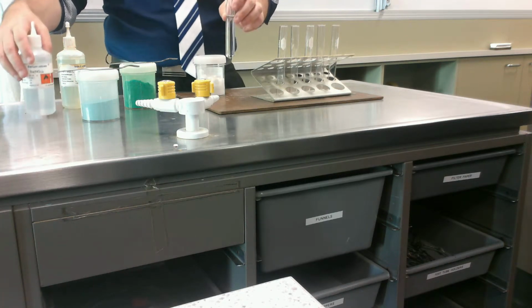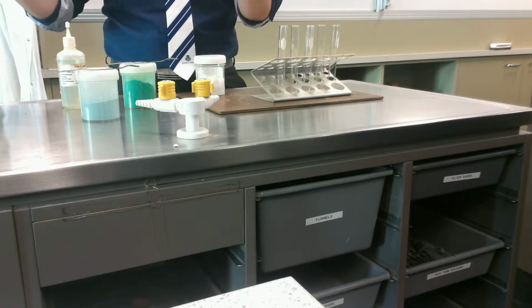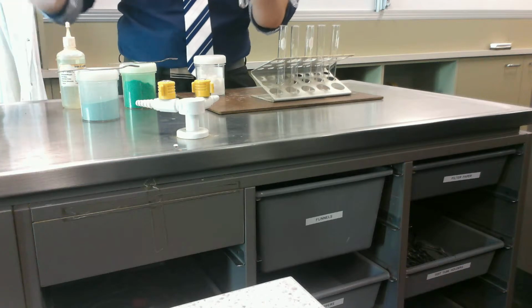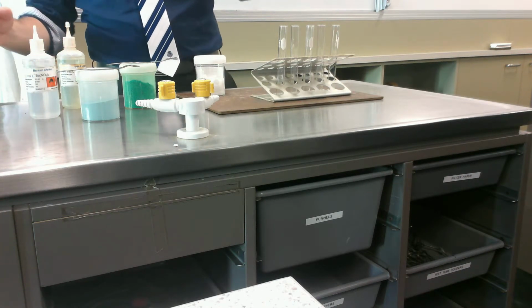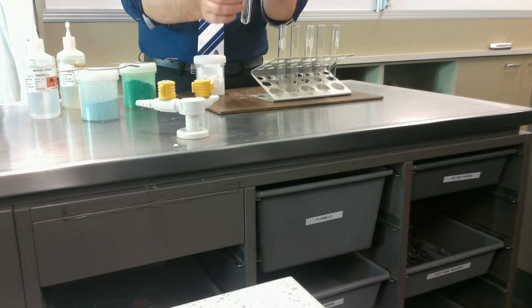It means if you see something that looks like water, it doesn't mean it's necessarily water. You wouldn't drink either of those, they're both poisonous. Okay, well, magnesium sulfate not so, but definitely barium nitrate. So here we have a solution because the solid, the salt, disappeared in the solvent.